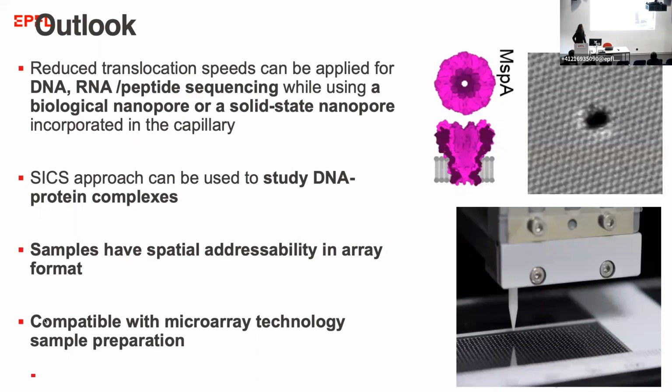So in our approach, since we are tunable on the size, we can really examine different types of combinations of single molecules, so DNA plus proteins, or single-stranded DNA, or double-stranded DNA, RNA, anything that one can imagine.